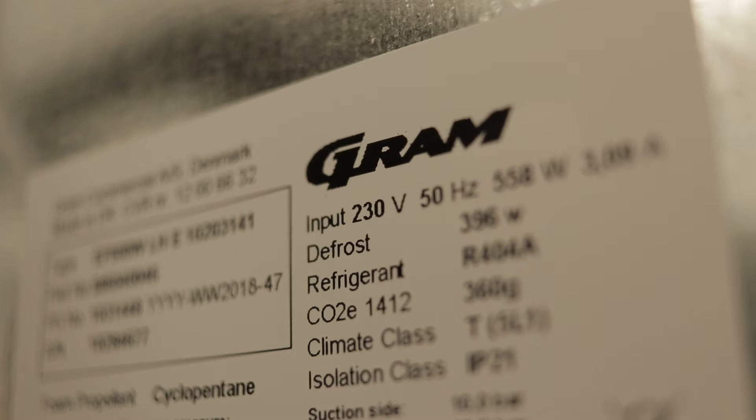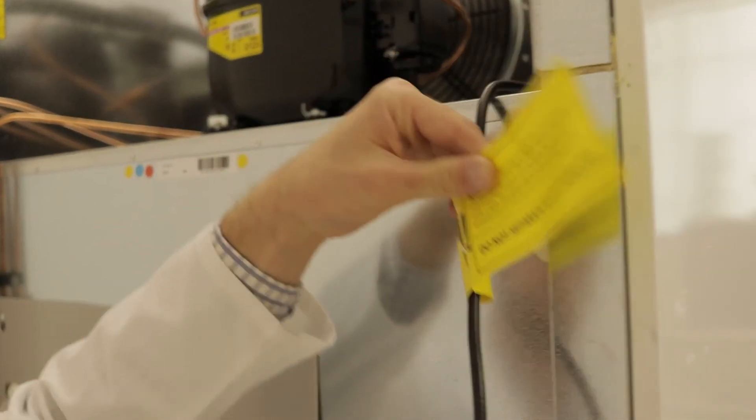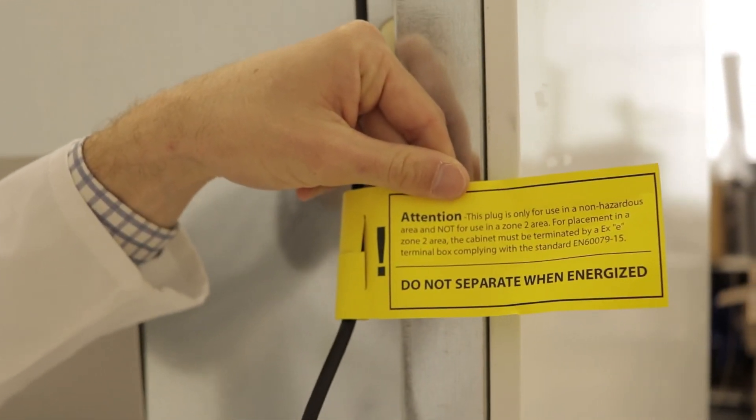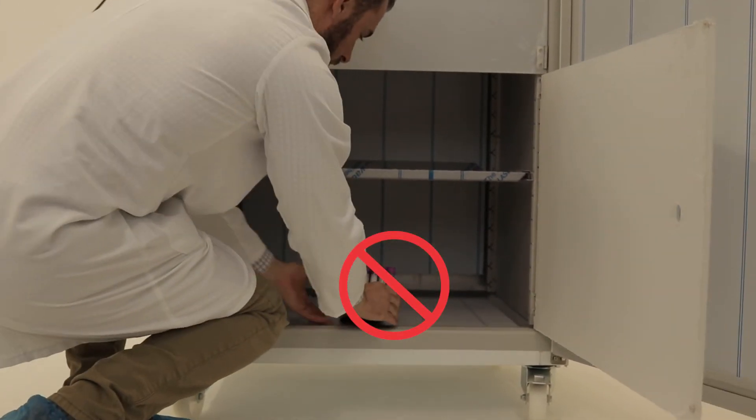Once plugged in, ensure that the electrical cabinet is secured in the terminal box with hanger. Be sure to mark the electrical cord width — do not separate when energised.